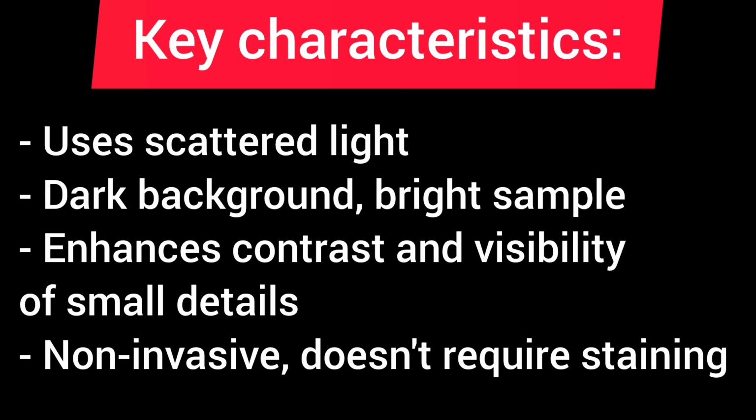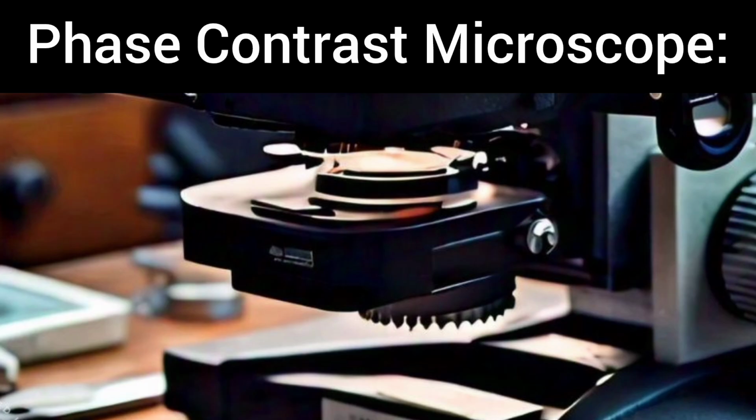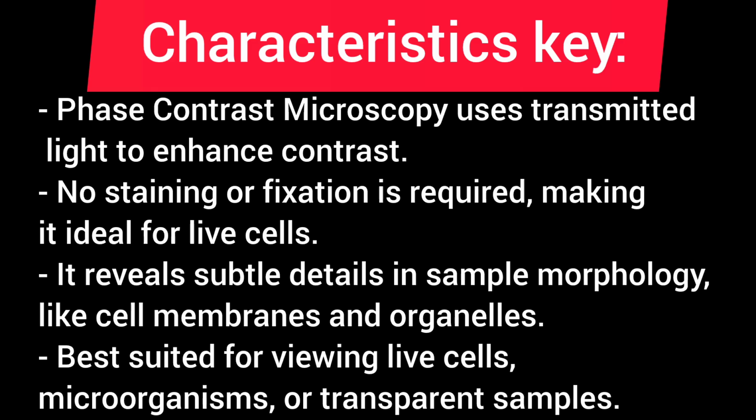Non-invasive, doesn't require staining. A phase contrast microscope is a type of light microscope that uses a special technique to enhance the contrast of transparent or translucent samples. Key characteristics. Phase contrast microscopy uses transmitted light to enhance contrast.